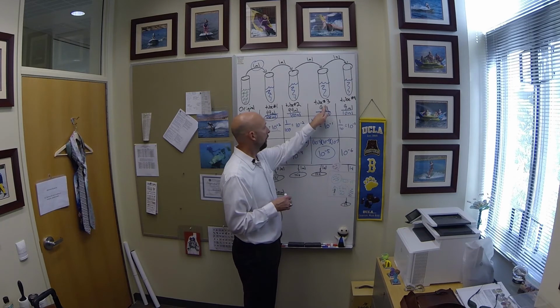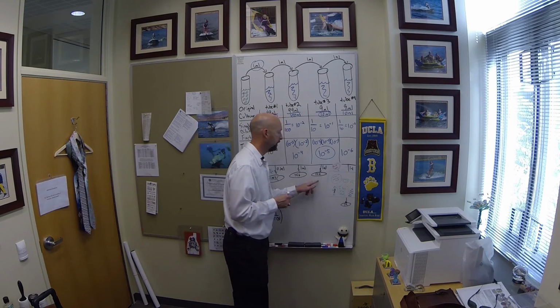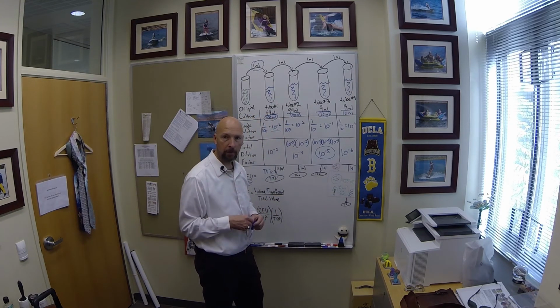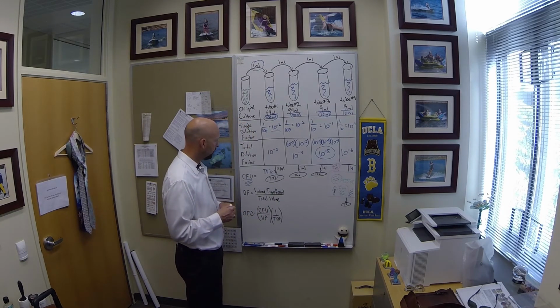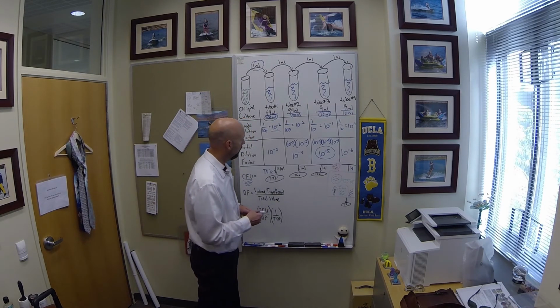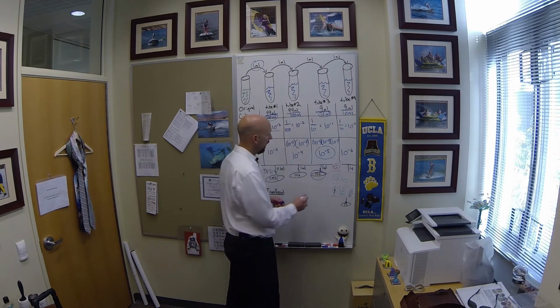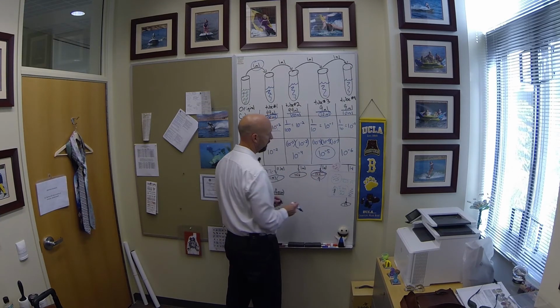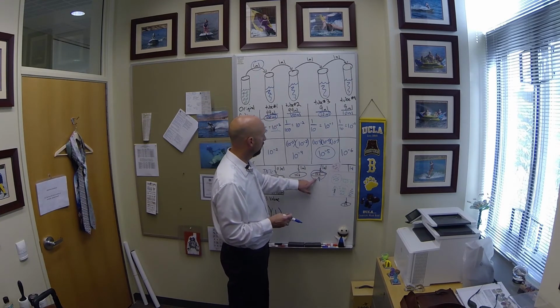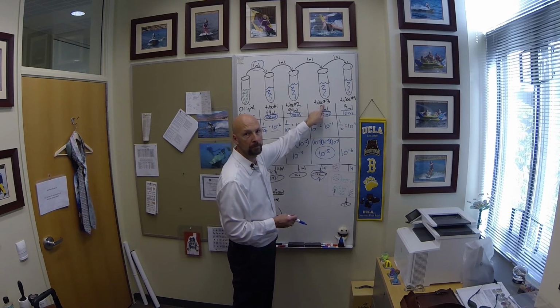But I skipped tube number 3. In tube number 3, we plated 1 mil. After incubation, we count 132 colonies, or 132 CFUs. That is perfect because it's between 30 and 300. And so now we have everything that we need. We have 132 CFUs. And in the tube where this sample came from, we need to know what the total dilution factor is in that tube.